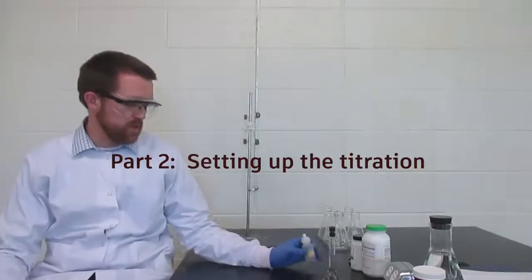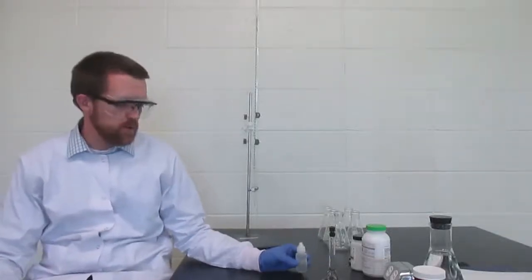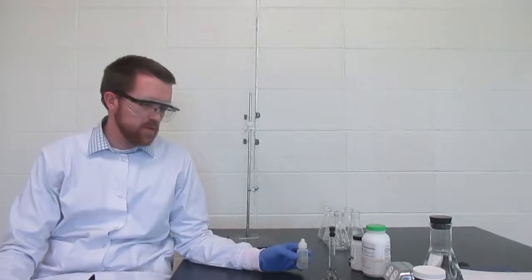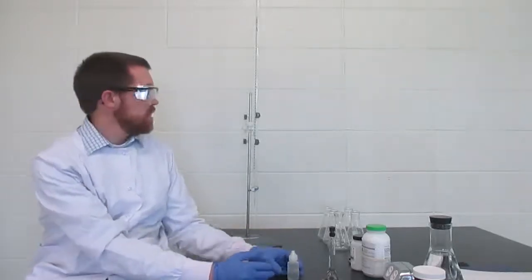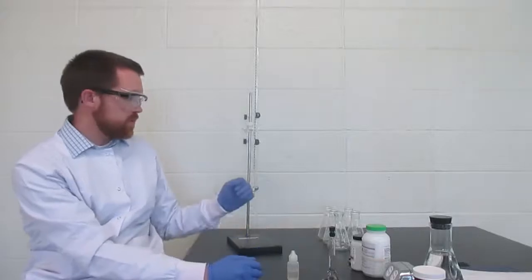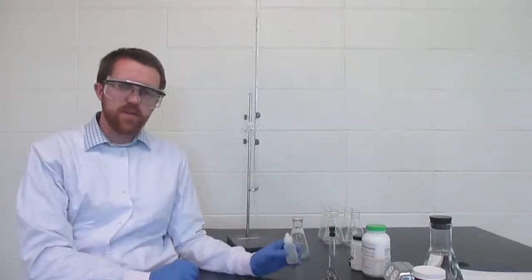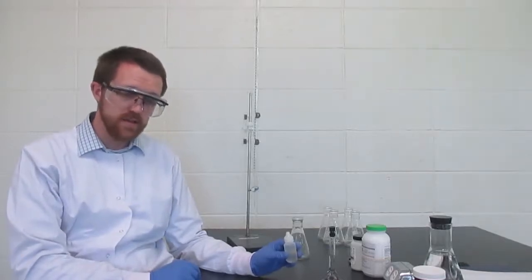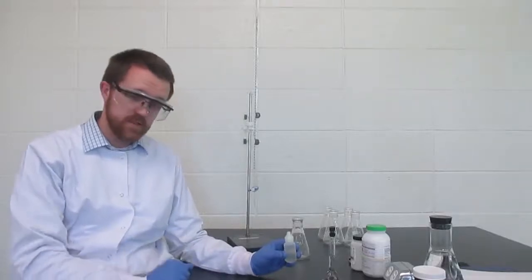In this acid-base titration we're going to be using phenolphthalein as our indicator. Most of this is normally told in your lab procedure, but the reason I'm making a note of it is because that will determine which of our two solutions we will use as our titrant to go in our burette and which one we will use as our sample to go in our flask. Phenolphthalein is an indicator that is colorless in an acid but it turns pink or red in a base, in a strong base.